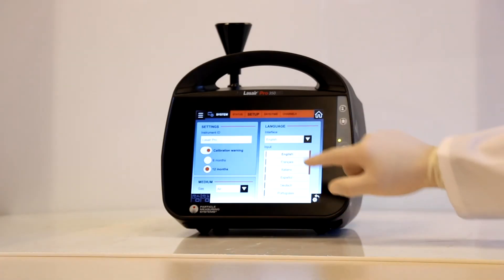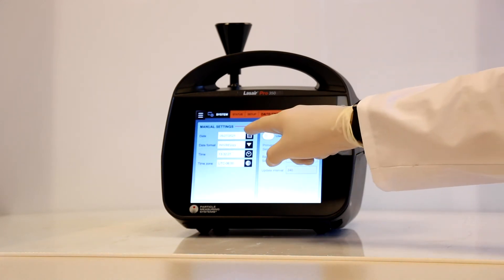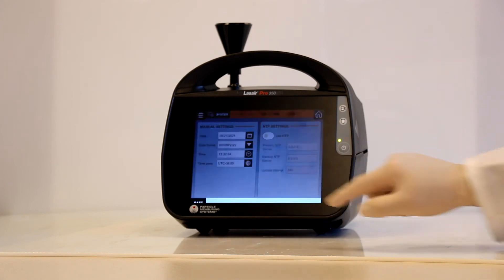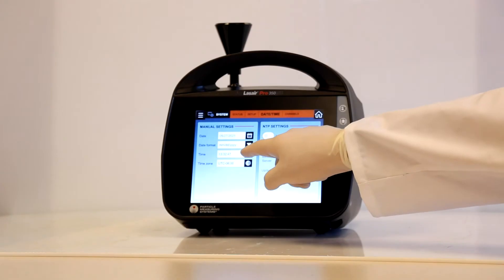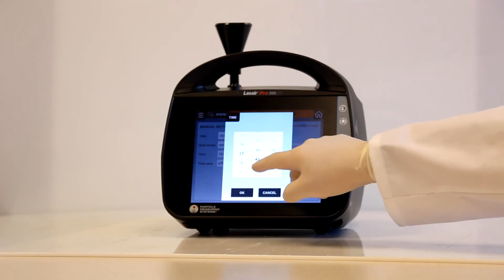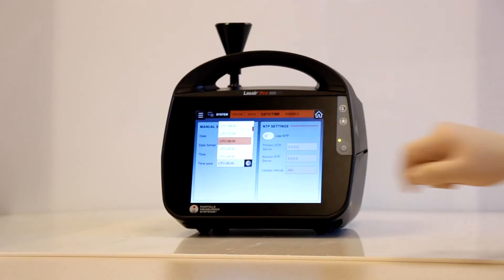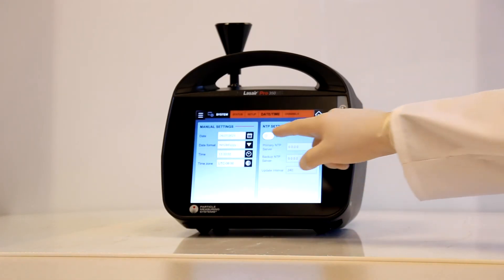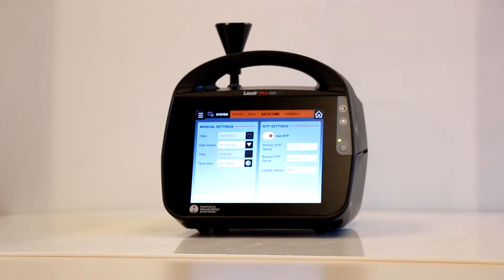The Date Time tab allows you to configure the date and time manually on the unit, or by using the Network Time Protocol you can enable the unit to synchronize with your network.